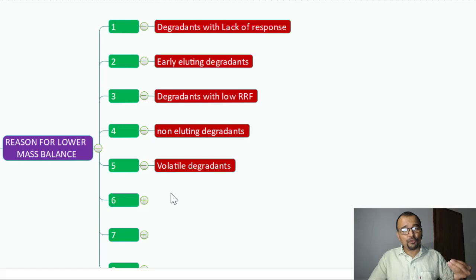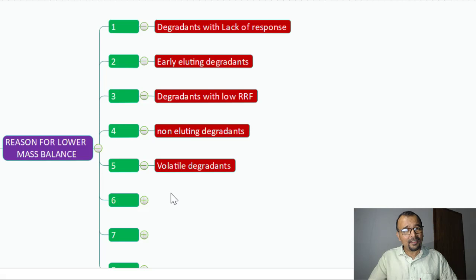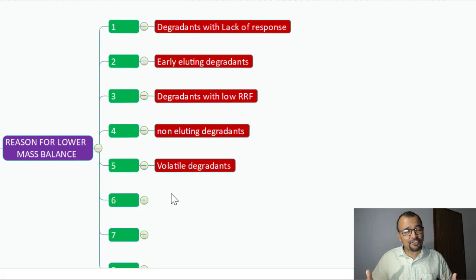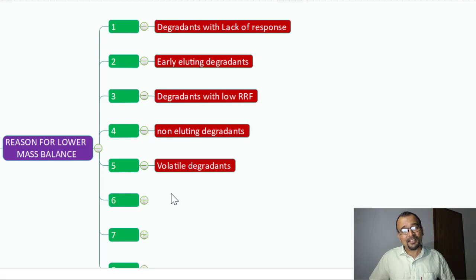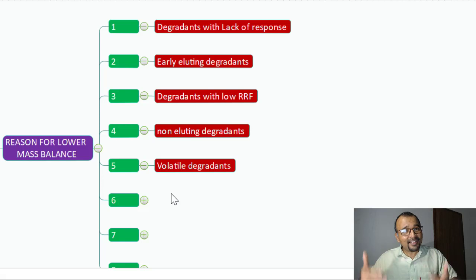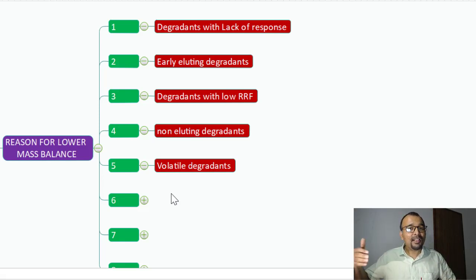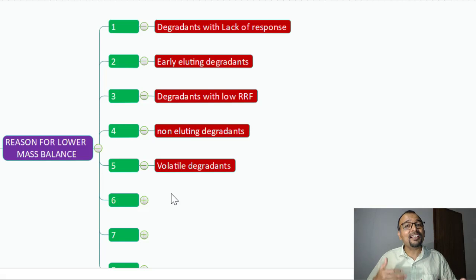Volatile degradants. If you are treating the sample solution with thermal treatment and there are degradants which are volatile or gaseous in nature, they will easily escape out of the sample solution during the treatment itself. You will not have any chance to detect those volatile compounds during chromatography, as they have already escaped your sample solution, resulting in a loss of mass.